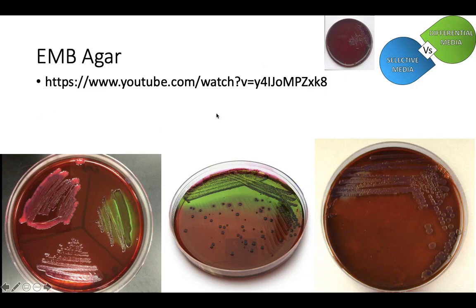You are able to eat lactose. You eat lactose, you produce an acidic waste byproduct. E. coli is our champion here. This is E. coli right here as well as right here. E. coli produces an acidic waste byproduct. It can eat lactose. It starts producing that acidic waste byproduct. It's released into the environment, into the agar, and it's going to cause the E. coli cell to suck up large amounts of methylene blue from the environment. That methylene blue gives the E. coli that green shimmery tint to them.